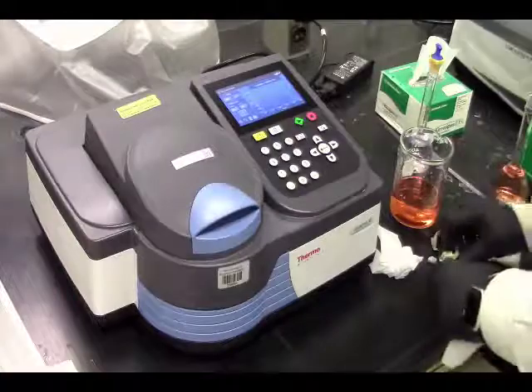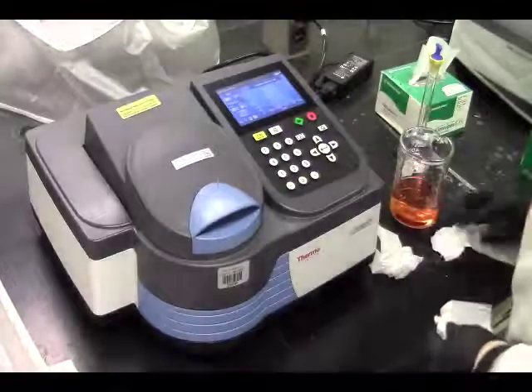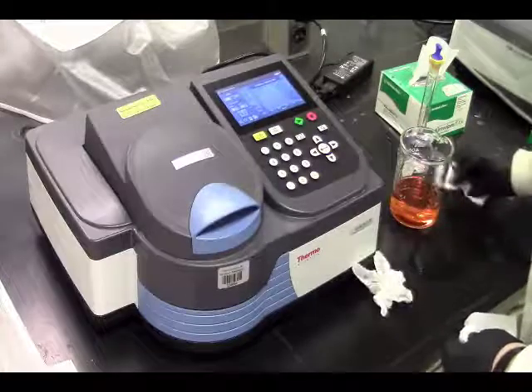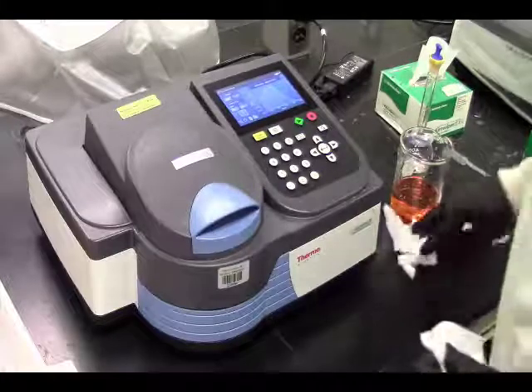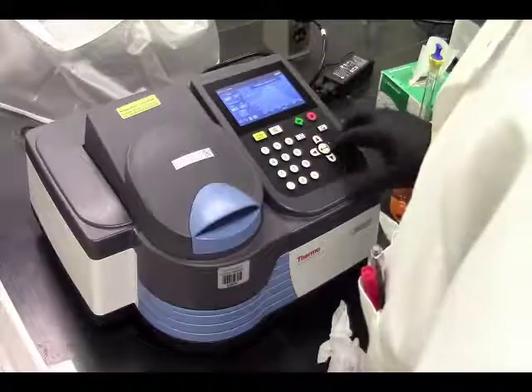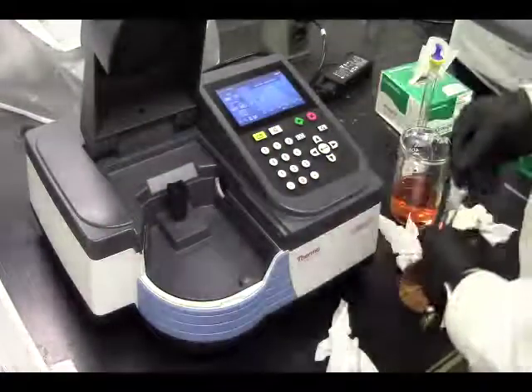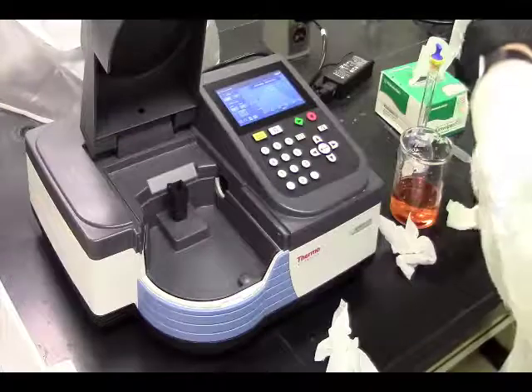And we won't use our top anymore here, I guess. Well, we can set it on lightly. Don't want it to get stuck in my volumetric flask, though. Have had that happen. That's not fun. Probably a problem with the glass stoppers, though. 0.142. That does not sound good. Yeah, they broke. They got the ring. Dr. Son was over here.